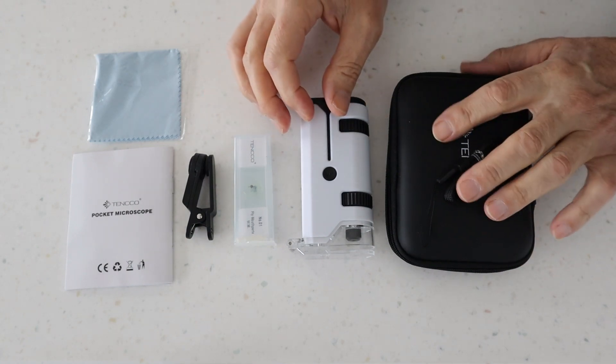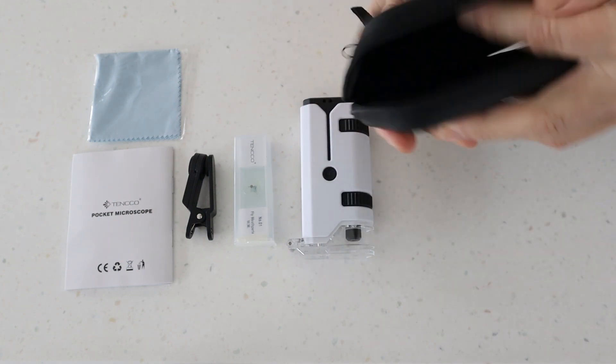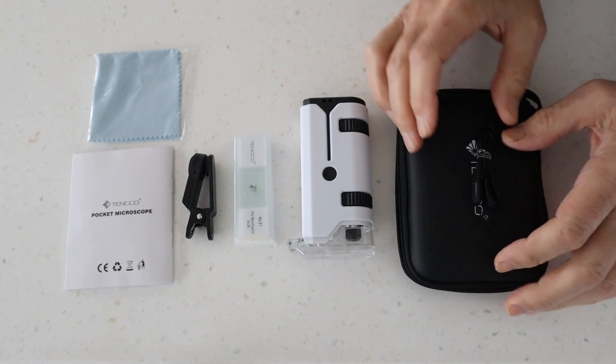So we've got our Tenko Pocket Microscope unboxed. The first thing that struck me is this case, which is really, really nice. Everything just packs away into this case, keeps it nice and safe and everything together. So that's a really nice touch.